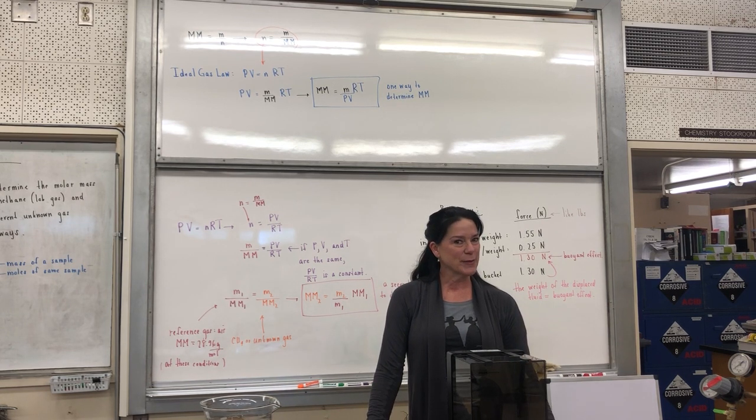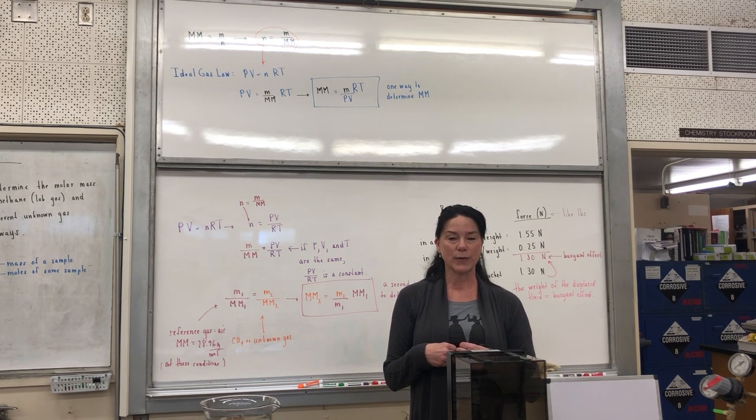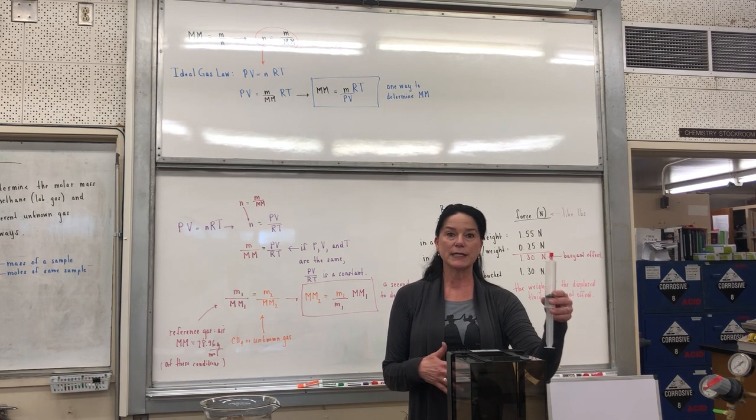Do I weigh less in a swimming pool? No. It's because the water has a buoyant effect on my body. And that happens anytime the thing that is measured, the weight of me, is displacing some fluid that it's measured in. In the case of the pool, that's the water. But what we're doing today in a lab, the fluid is the air around it, and there is that buoyant effect.